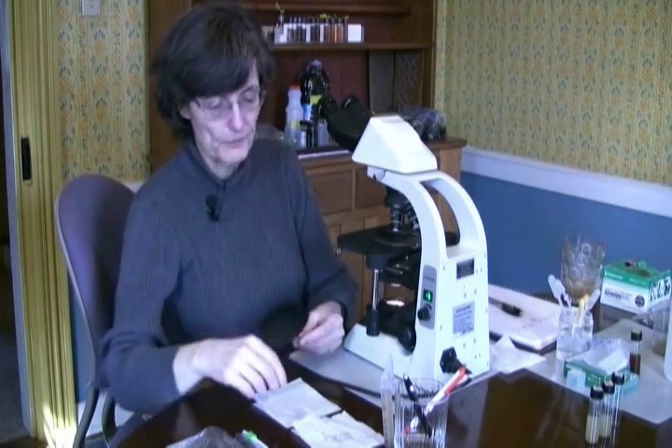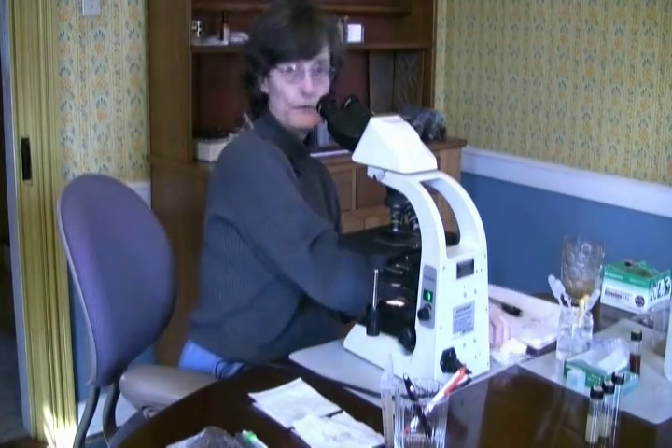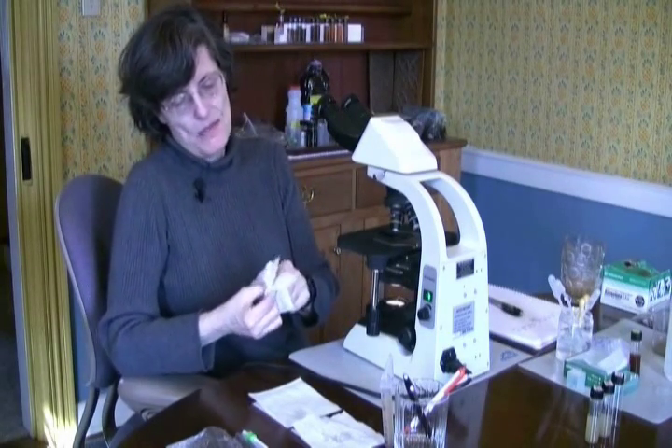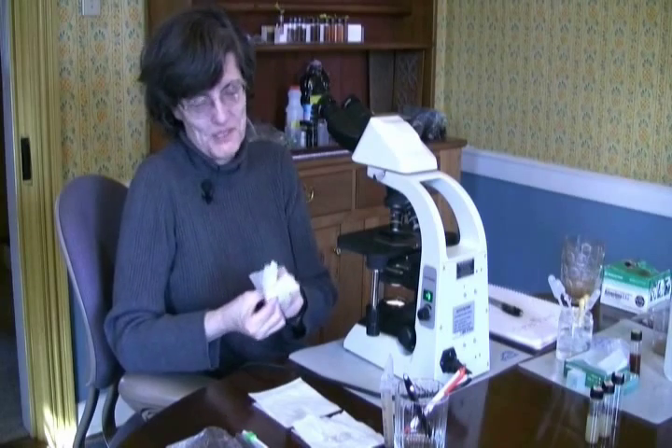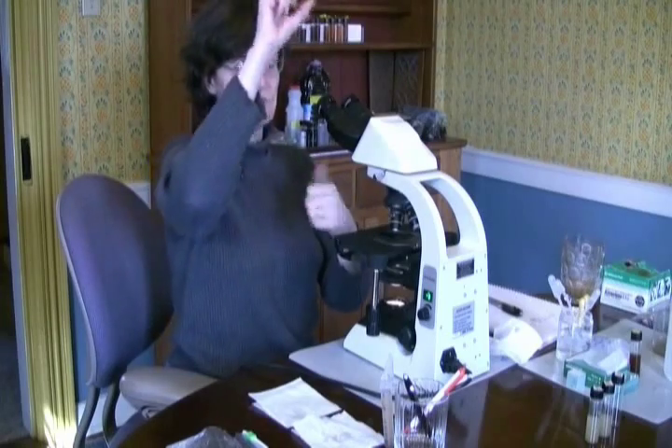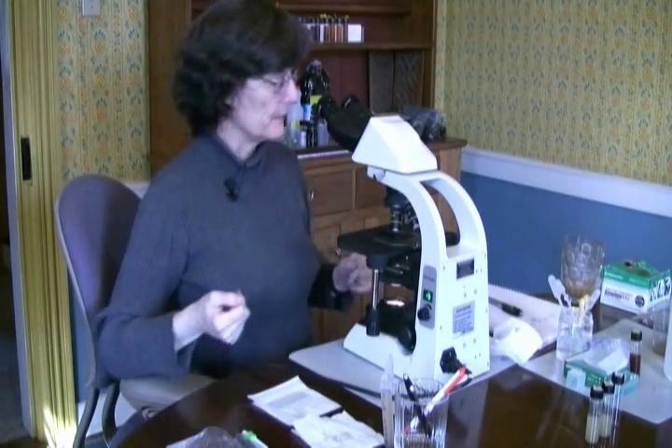Make sure this is all properly cleaned up. If it's not looking real clean, use the cleaning method of choice by microbiologists — pretty simple. It's not going to take a lot of effort to be ready for my next sample.